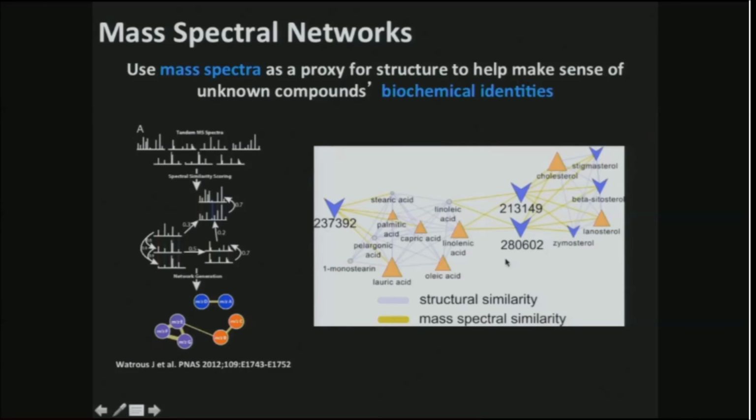And so now I can mine this and try to get a better idea of maybe what biochemical domain these species are coming from. And so for example, these 2, I see they're kind of spanning the range between sterols and fatty acids. And they have the same color and shape as actually 3 phytosterols. So in my system, they're changing in the same way. And so I might conclude that these could likely be phytosterol esters, or sterols hooked to a fatty acid. And so that could help me constrain my database search.